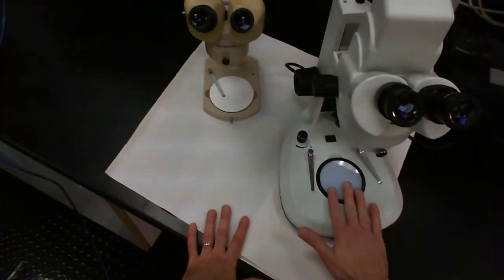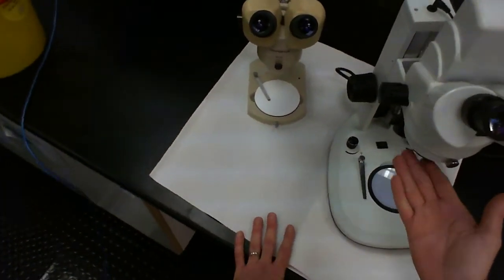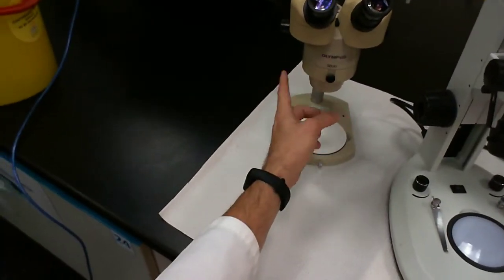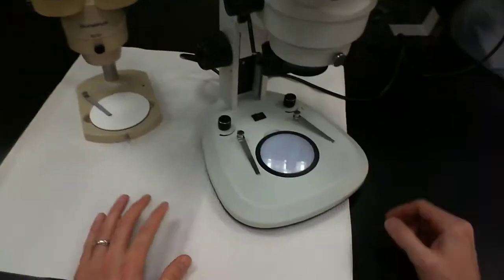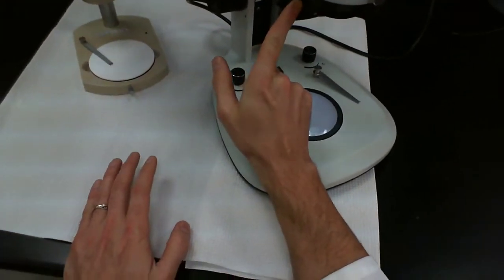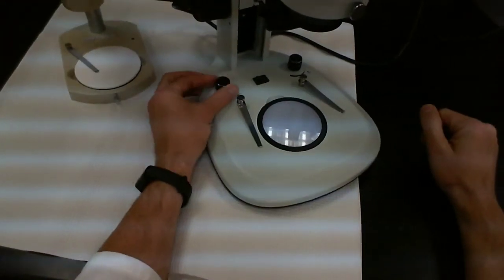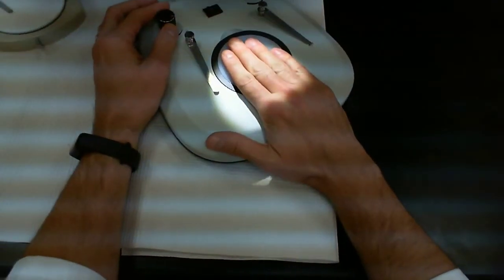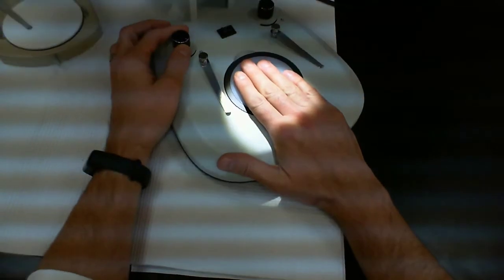Just above the stage we have objective lenses. You may not really believe this, but there's an objective lens in here and also in here. There's also a light source visible here, a built-in light source which I can control using a knob. You can see here I can put a three-dimensional object on this stage and light it up.